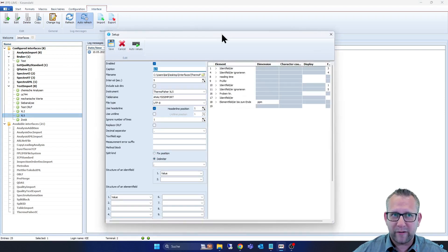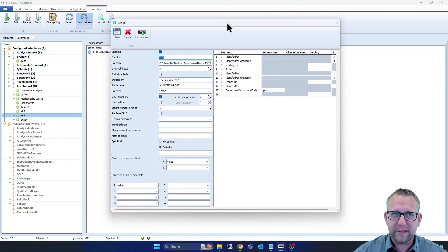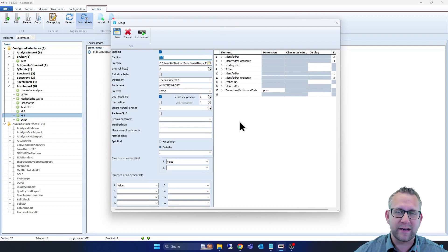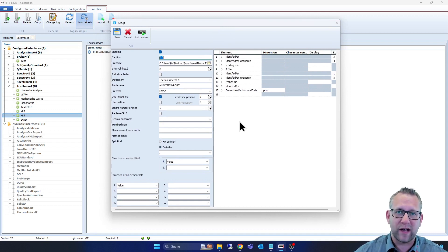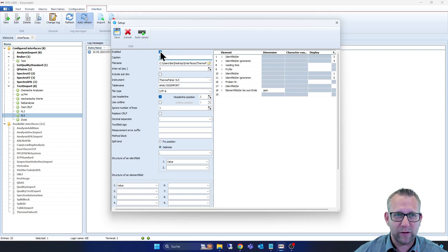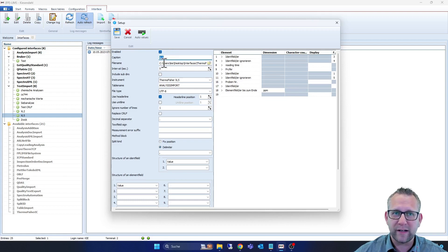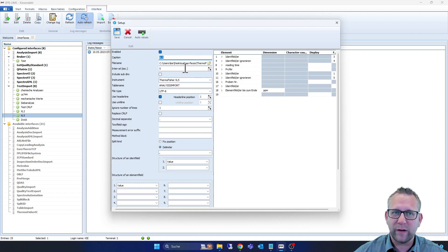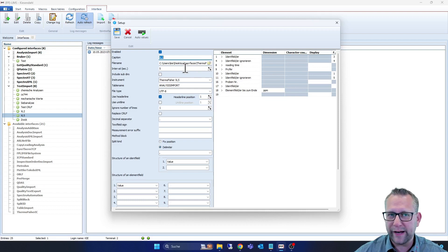And if we are here in the setup from our existing interface for the XL5 device, we see here it's enabled so it works. Then we see the caption of this one, the file name, the path that we pick the result file from the device. We have here an interval you can create, the interval that you need.